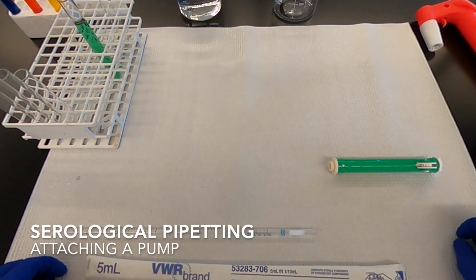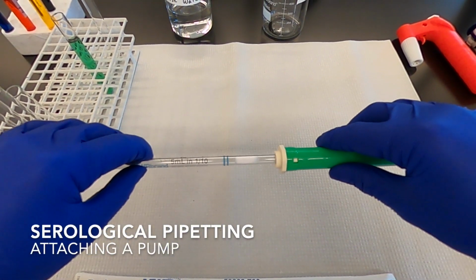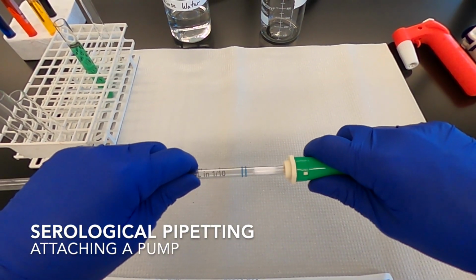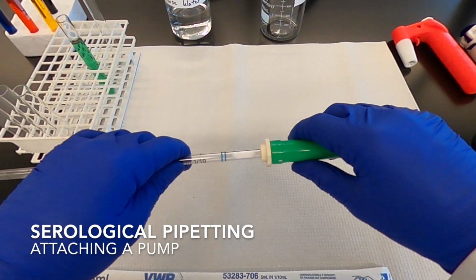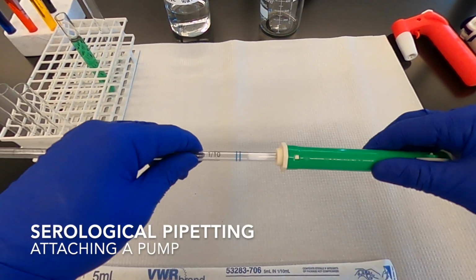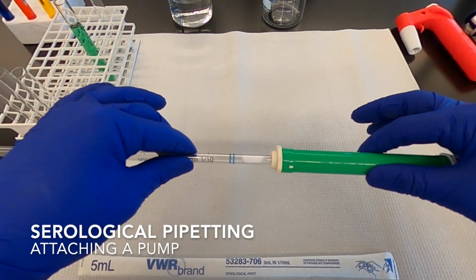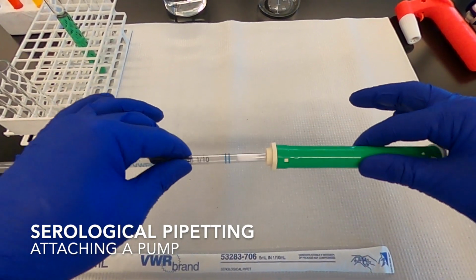To use a pipette, you need to attach it to your pump and check that it's properly sealed. So just kind of push it on here gently. You don't need to push very hard. The pipette only needs to go in about that far. Make sure it's snug, so if you rotate it, it should spin with the pipette. There should be no wiggling here, and it shouldn't be very wobbly either.